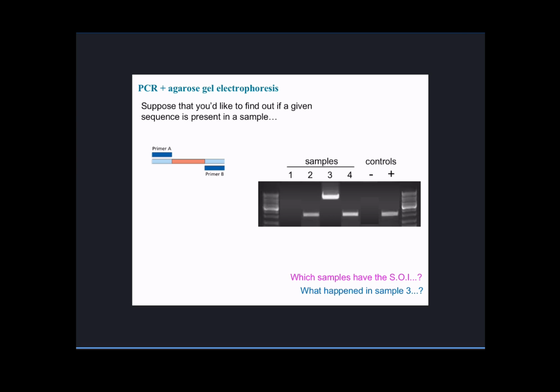But you elaborated on that idea and you said, well, maybe they're binding differently and they're just further apart from one another and they're amplifying an amplicon that is much longer, right? Now, are they still binding to your sequence of interest, or are they binding somewhere else? It might include the sequence of interest, or they might be binding somewhere else.